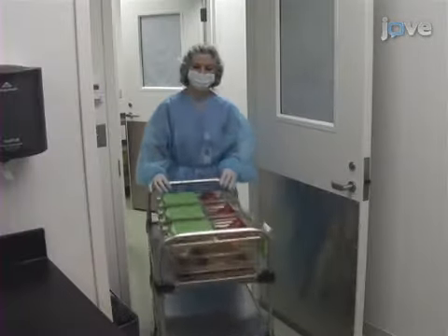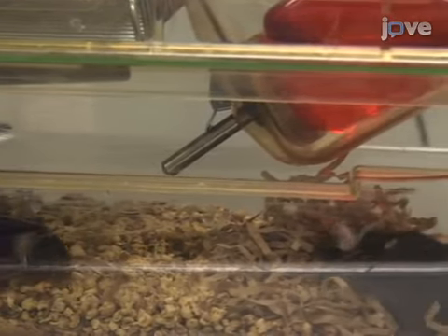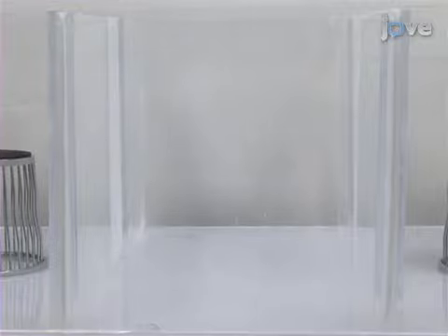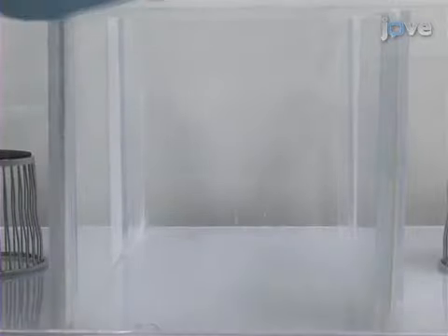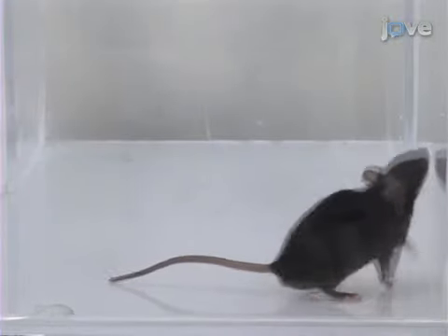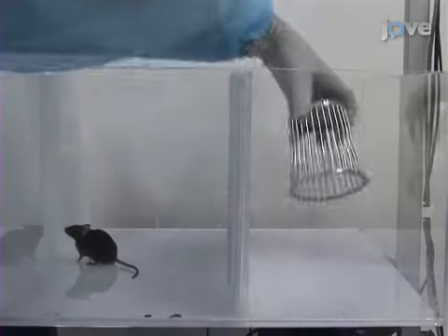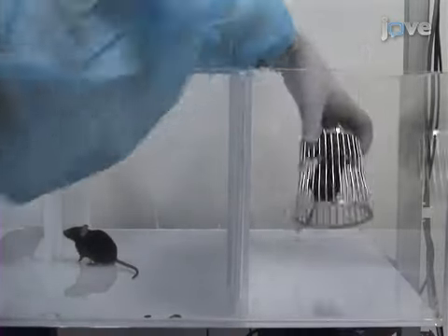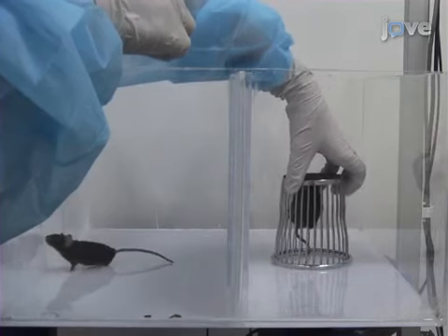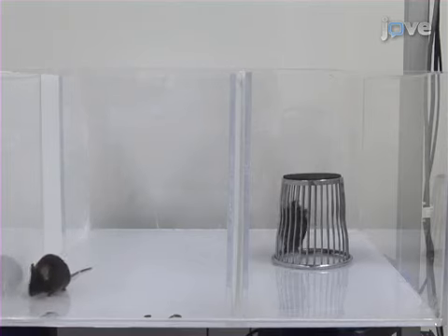Begin by habituating the experimental animals to the test environment for 30 minutes. With both cups in place and the dividing walls closed, introduce a naive mouse to the central chamber and allow 5 minutes for acclimation. Place a control mouse, Stranger 1, inside a wire containment cup. Alternate the placement of the control from the left to the right side of the chamber between trials.